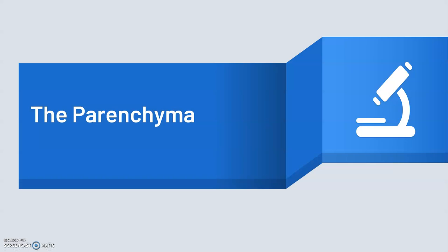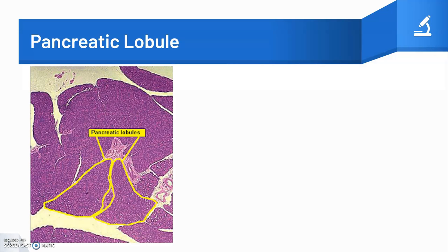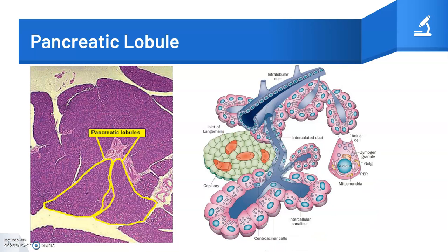The parenchyma is made up of different structures. One of them is the pancreatic lobule, which is composed mostly of acinar tissue. Islets of Langerhans and pancreatic duct branches are also present. The exocrine component makes up the vast majority of the lobule.